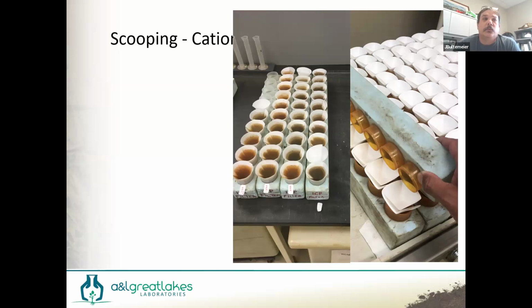contact with each other? So we're really trying to find out what's extractable, and that extractable amount is not relative to any particular fraction. It's not directly related to what's plant available. It's not directly related to what the soil will release in a year. And that's the thing that's hard for people to maybe wrap their head around. It is an index. It is a measurement. And we'll get into more detail of it, but think of it here in the short term like a tape measure. An inch. We all know what an inch is.